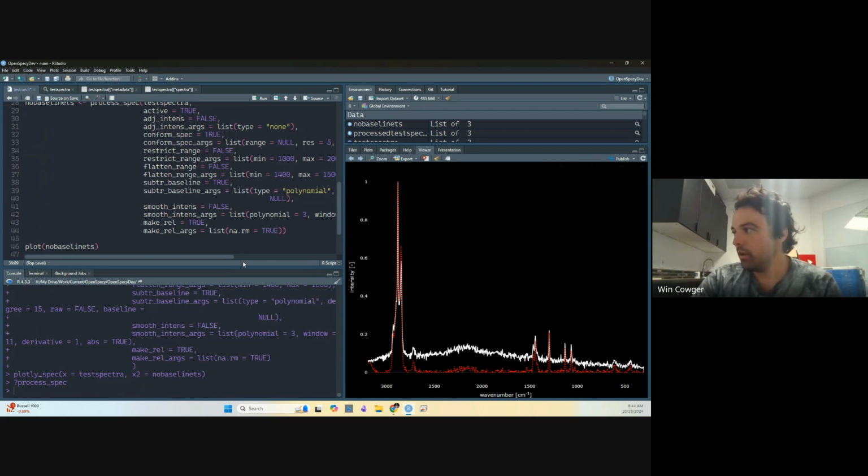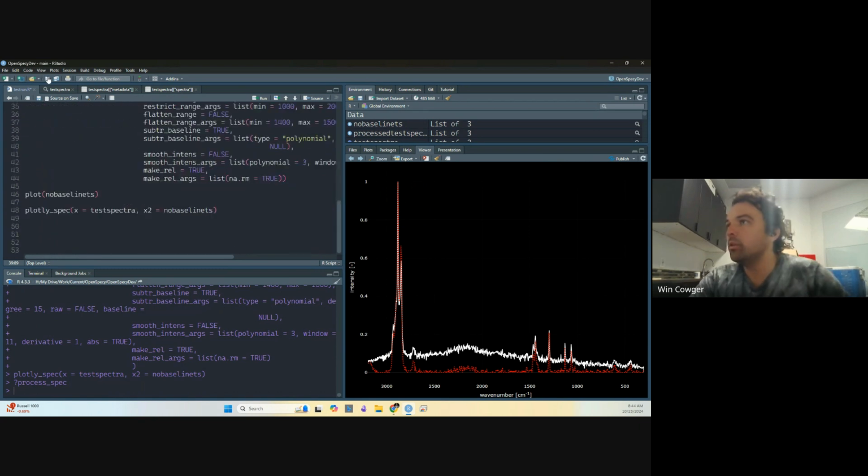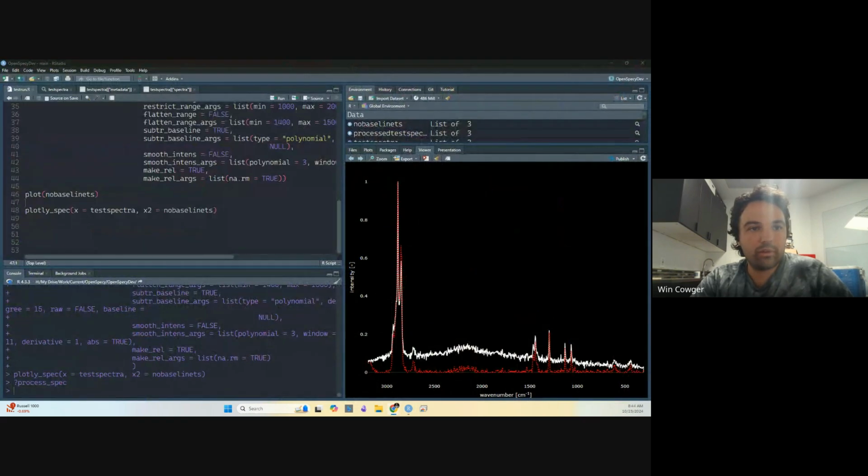All right. So for the last thing, there are two other things I wanted to talk about. I wanted to talk about identification, and then I wanted to talk about where to get more information.